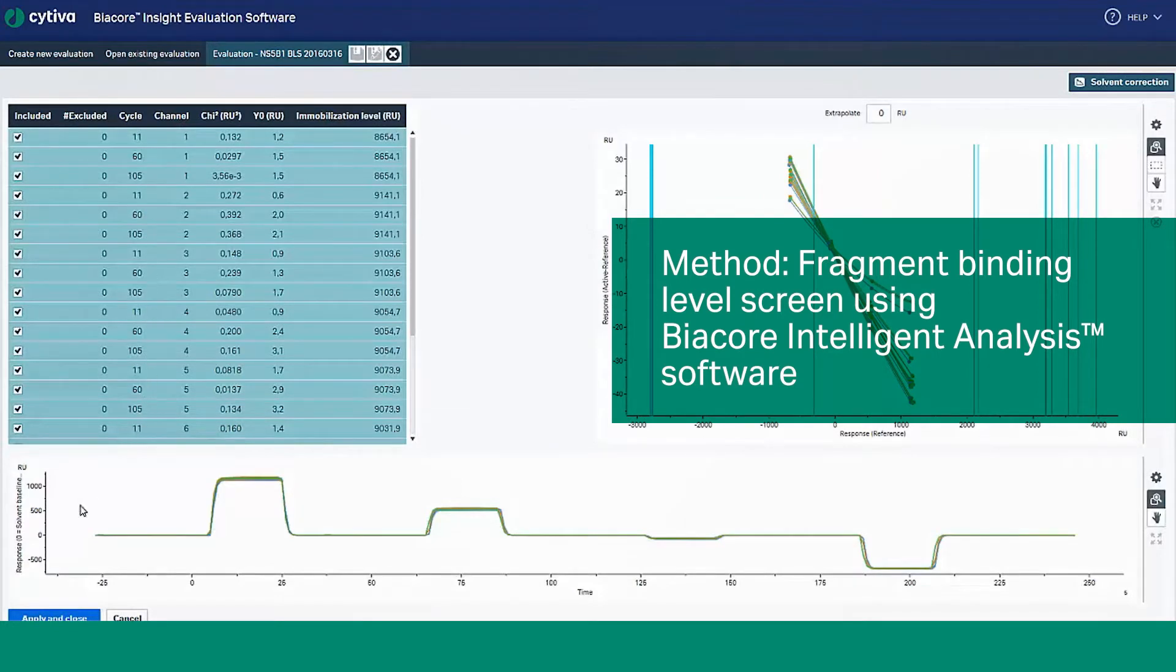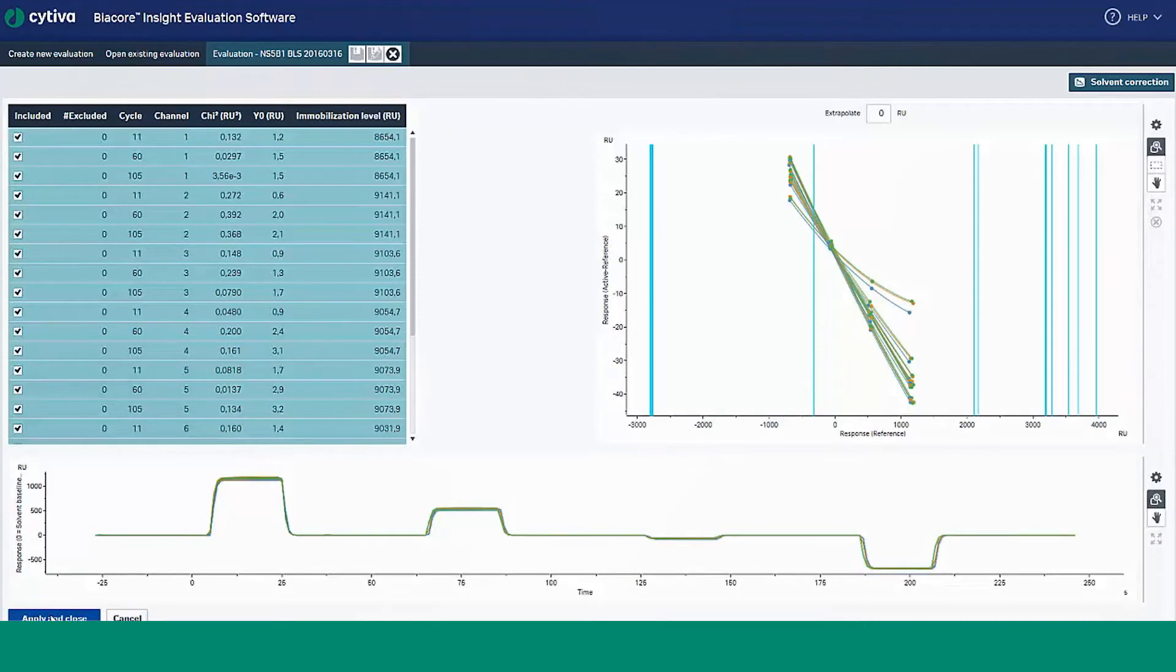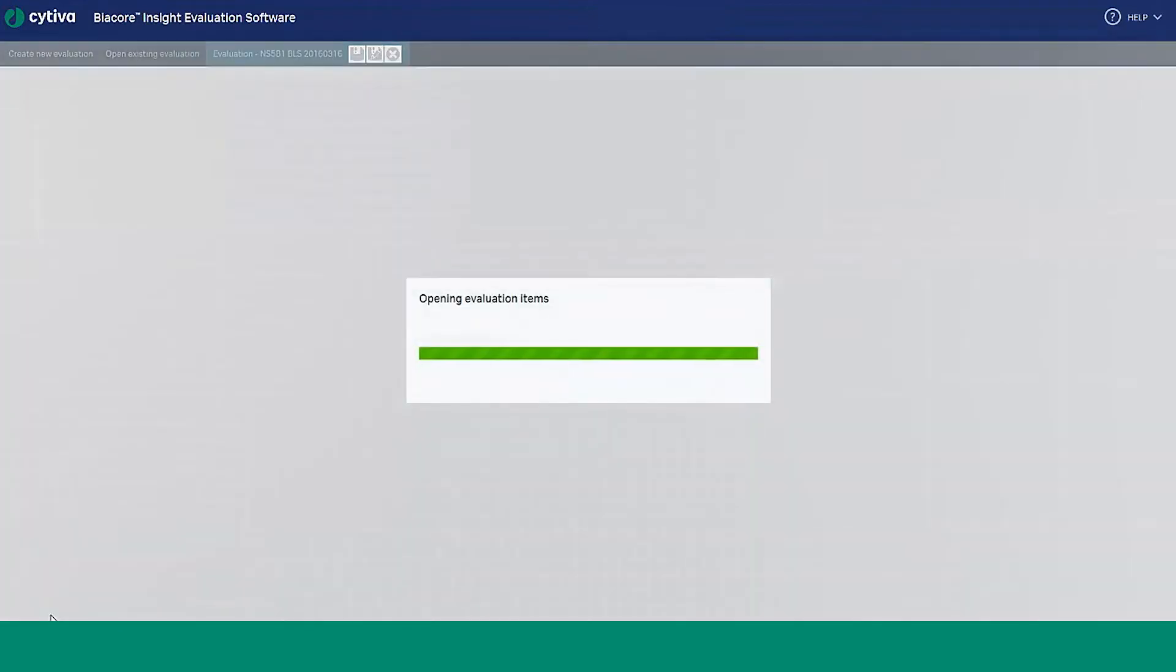Once the file is open, assess the solvent correction, select Apply and close the window to finalize your Binding Level Screen data using the prediction model.